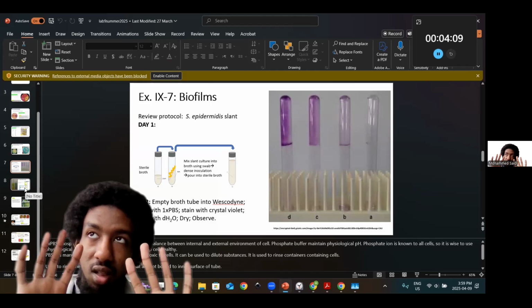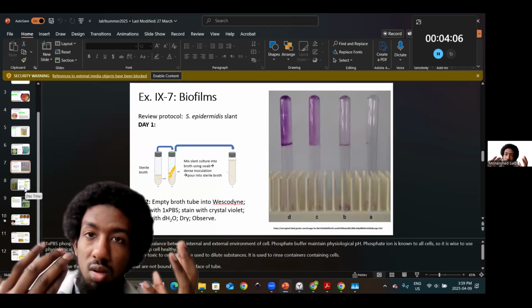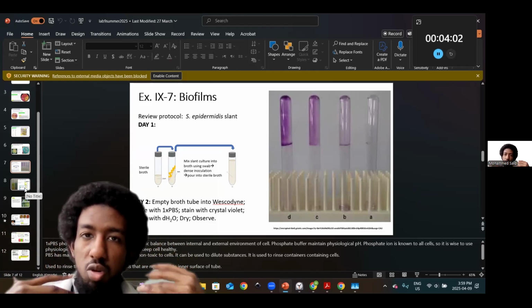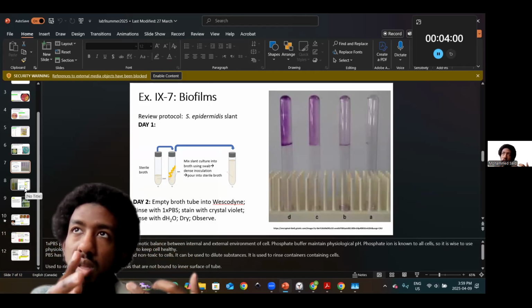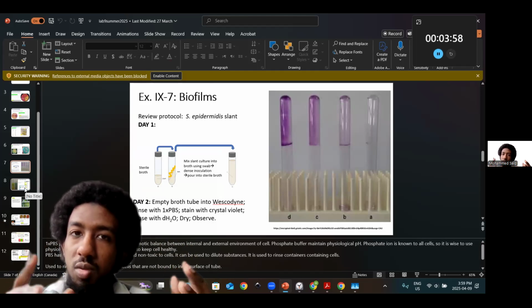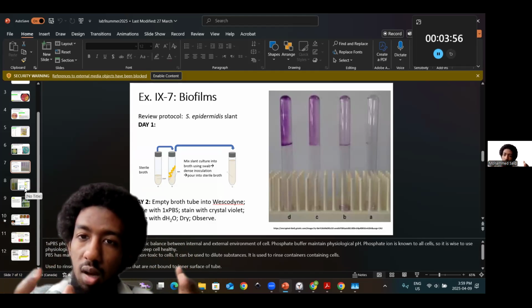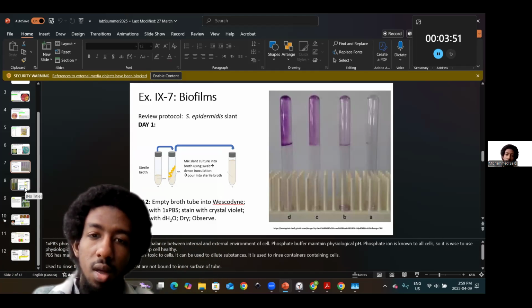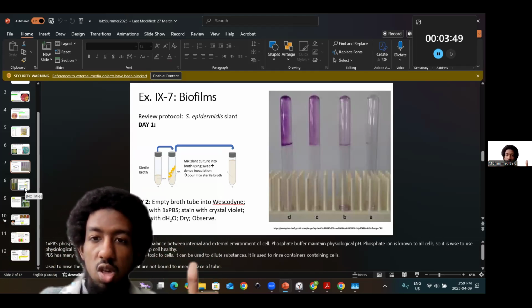But think about this as a lining of bacterial secreted products. That could be sugars on their surfaces that were removed from the surface of the bacteria, but are now on the residual surface of your tubes internally. But you can see the degradations, right?